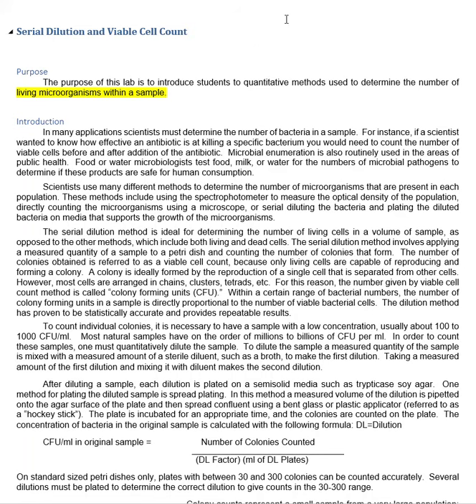First, you shine the light through a clear glass to get a standard, and then you can shine it through a bacterial sample, and the amount of cloudiness or turbidity is going to give us an indication of how many bacteria. However, that's going to count all bacteria, the living and the dead.